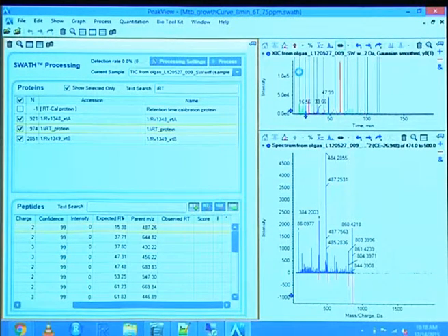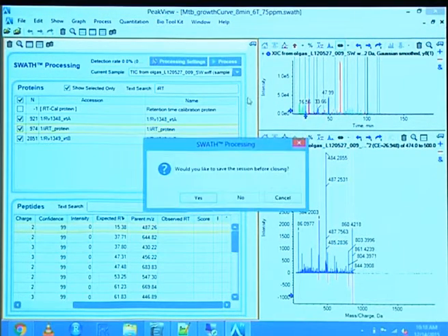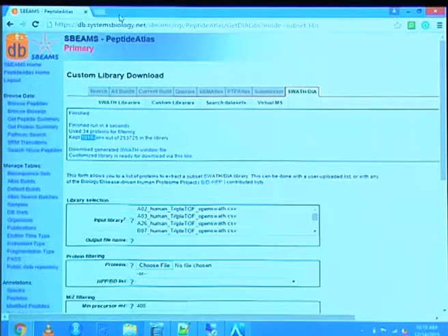Okay. Instead, what I do, come on, if it lets me, I will load the result section from that. In that case, I've used all the 9 files that you saw before, not just one set, but all of them. While that is loading, we're gonna go here.